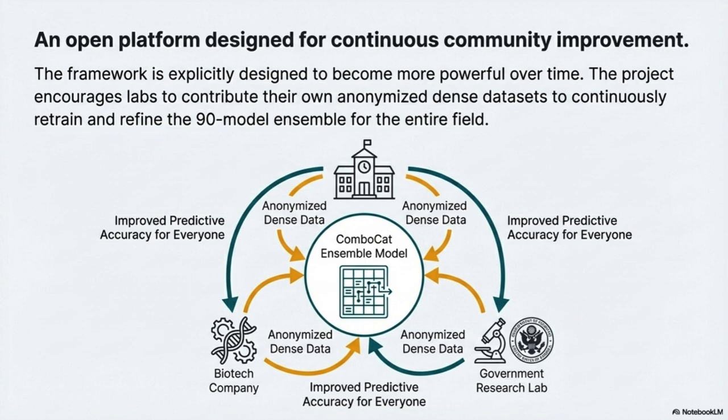The limitations are mostly practical ones. First, the quality of your training data is the absolute ceiling. You have to keep doing holdout testing. Second, like we touched on, that shift to tiny volumes in the 1536 well plates can sometimes cause small physical shifts in potency. And what about the math itself, the synergy models? That's a key constraint. So Combocat supports both Bliss and Loewe models, but they reported that the Loewe model was undefined in over 60% of the Sparse Mode combinations.